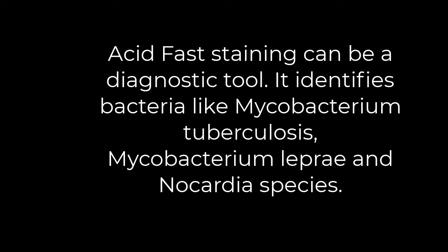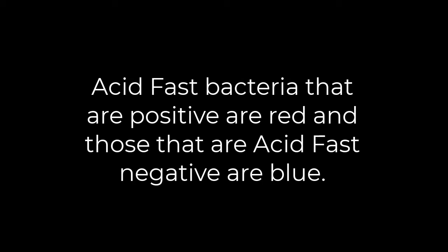Acid-Fast staining can be a diagnostic tool. It identifies bacteria like Mycobacterium tuberculosis, Mycobacterium leprae that causes leprosy, and Nocardia species. So it can be used just like the Gram stain as a diagnostic tool because it identifies bacteria that have mycolic acids in their cell walls.